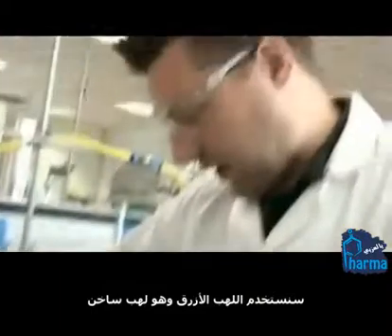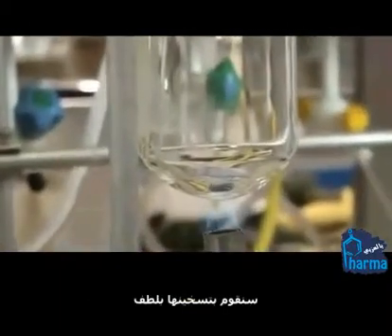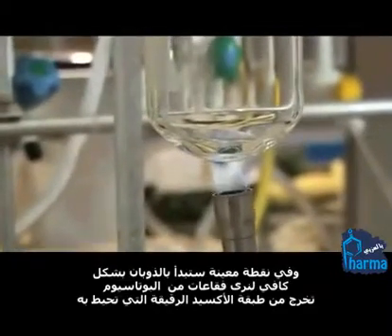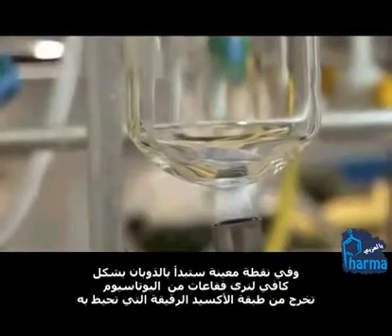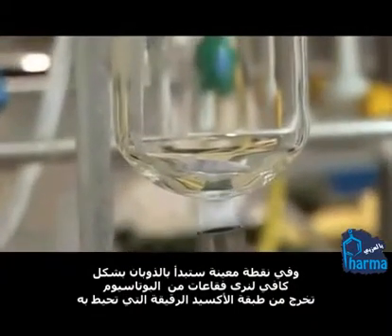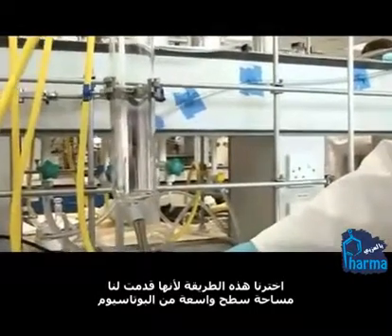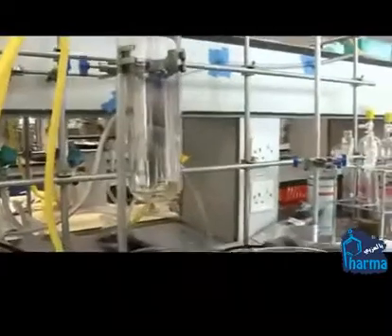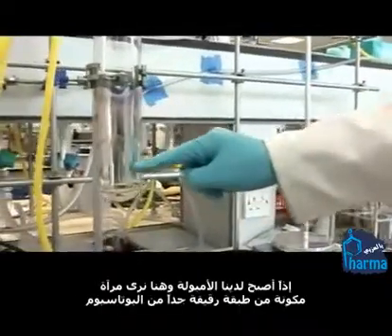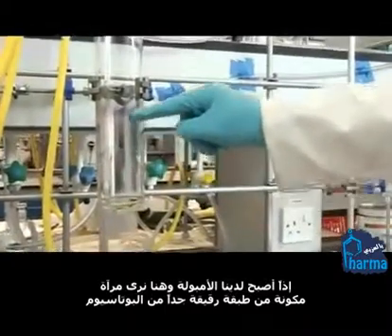We're just going to the blue flame, which is the nice hot flame. We'll just keep on gently warming it, and at some point it'll melt just enough that you'll start to see bubbles of potassium jumping out of this thin oxide layer which is coating it. And there's the mirror starting to form. The reason we do it like this is that we end up with a large surface area of potassium, so it's excellent for keeping our solvents dry. What we've got now is the ampule, and all the way up here this is literally a mirror of very thin potassium.